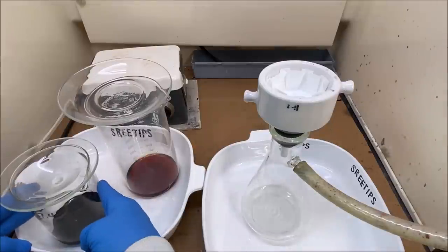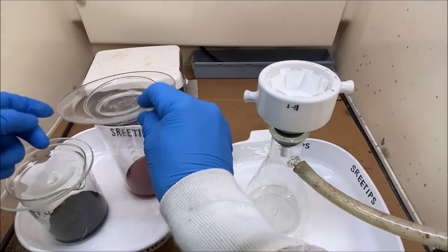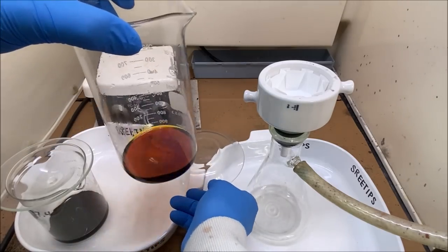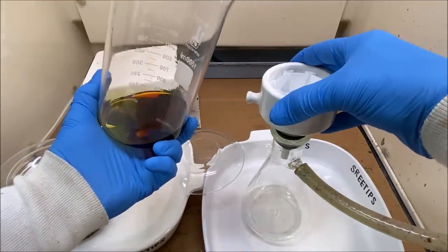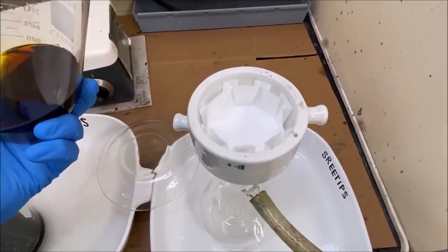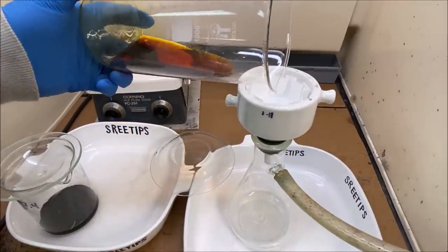I've allowed this solution to cool completely. And then we've got this solution that we poured off previously. It's got a little bit of solids down in the bottom of here. Not sure what that is, but we're gonna try to filter this out now with one of our specially prepared filter papers. I'm just gonna go ahead and filter this solution now.